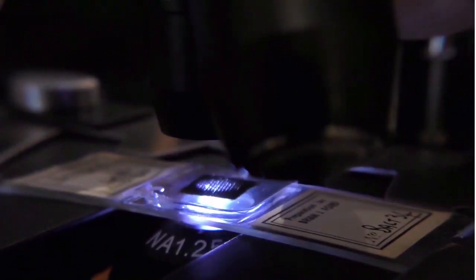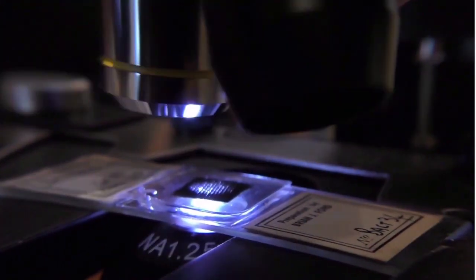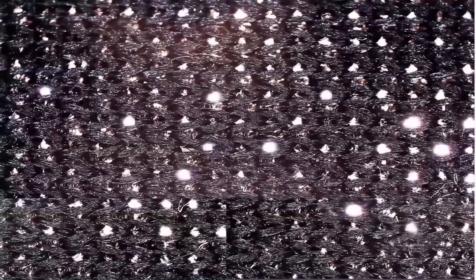If we mount a portion on a prepared slide for examination with the research microscope at 50 times magnification, we can discern the essential structure of the fabric.